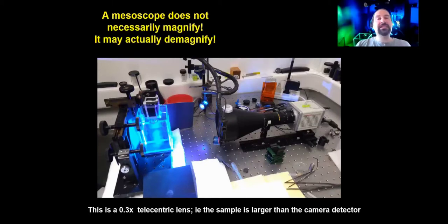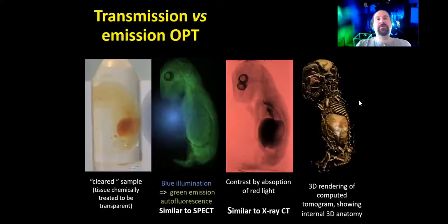The illuminating light needs to go through the sample and needs to get inside for you to actually see what's inside. With optical tomography, this is extremely important. You actually have to see through the whole sample in order to reconstruct a proper optical section later in the process. So that's one reason why typically you only see optical tomography applied to dead, fixed, and cleared samples. But if you get proper clearing and fairly well-mounted samples, you do get amazing results, even with a much simpler setup than what you're seeing here in this image.